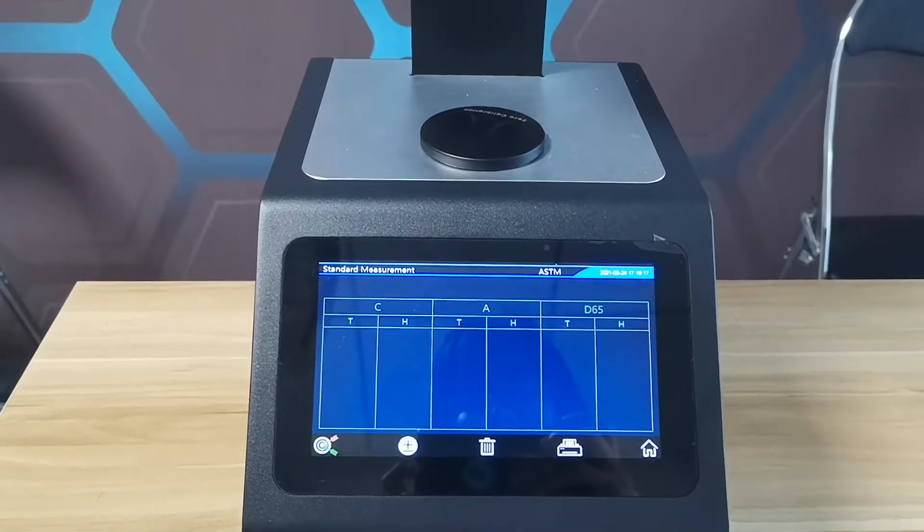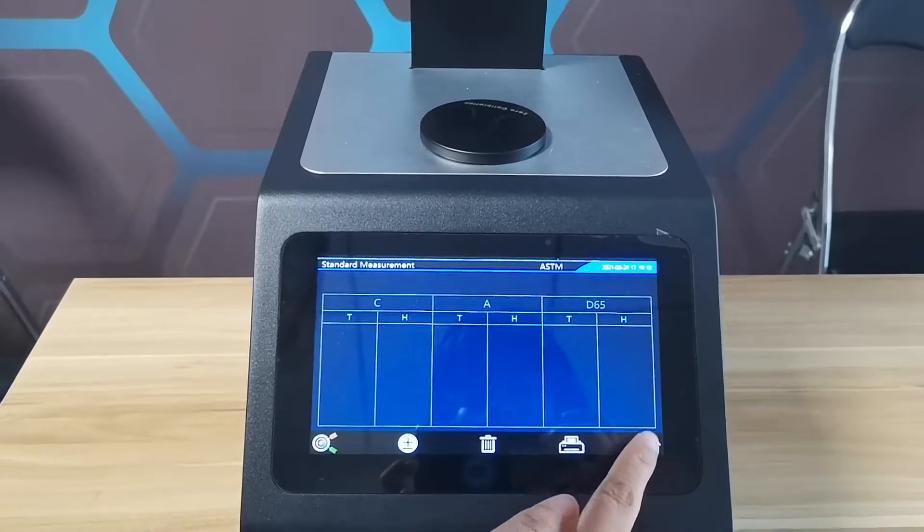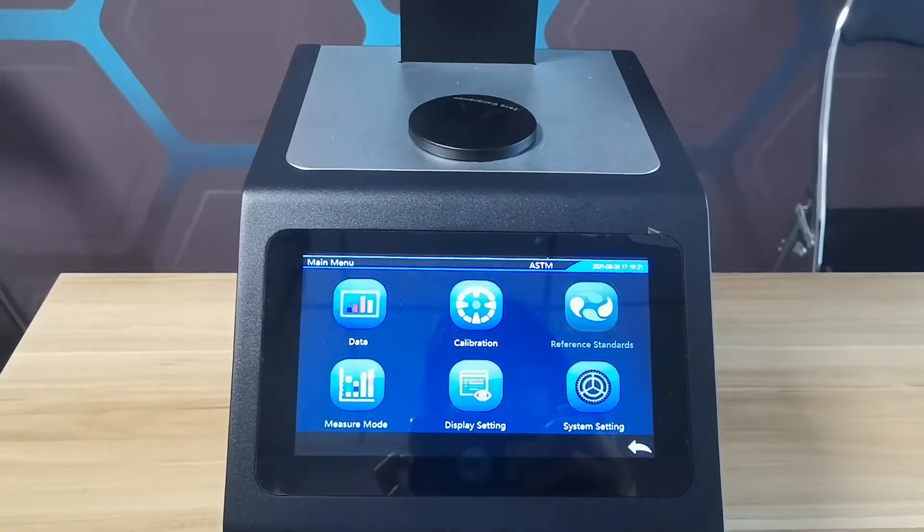This is the standard measurement interface. Return to the main menu interface.